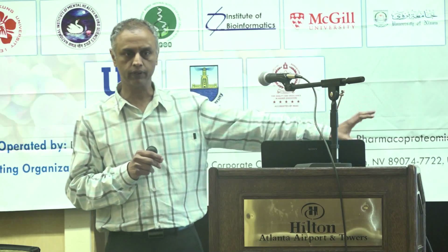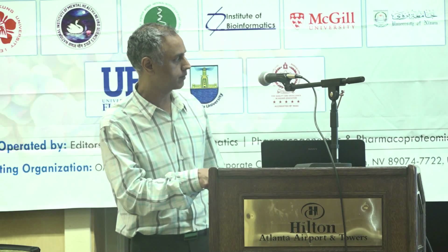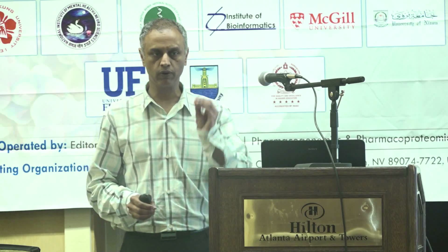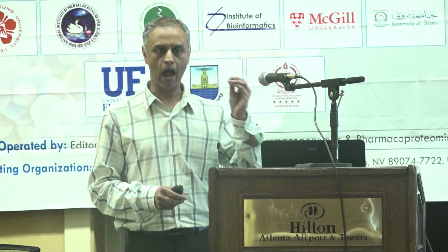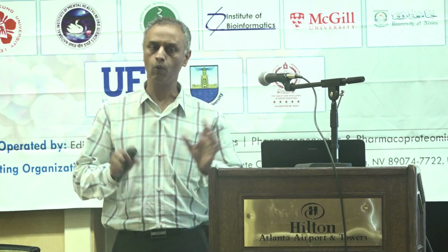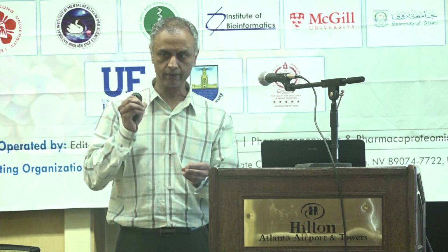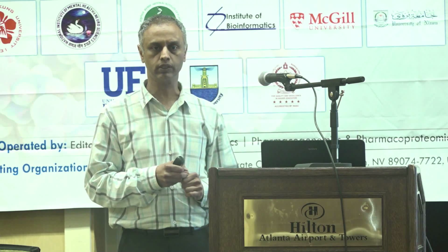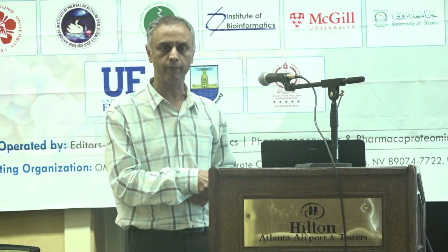Now we are talking about third world countries. Here, in 23 cases, we were given samples that were labeled as Mycobacterium tuberculosis. Our sequencing tells us it is non-tuberculous mycobacteria. What is also known is that co-infections do occur, but I think people don't have a good handle on that. Well, using these next-gen sequencing technologies and proteomics, we can tell them easily apart from each other.